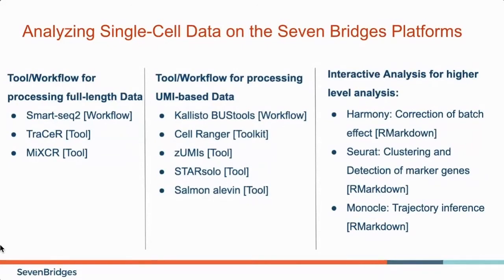We also have a Cell Ranger toolkit consisting of 5 separate tools. And we have extensions of the STAR aligner, called STARsolo, and the Salmon pseudo-aligner, which has an extension called Alevin.